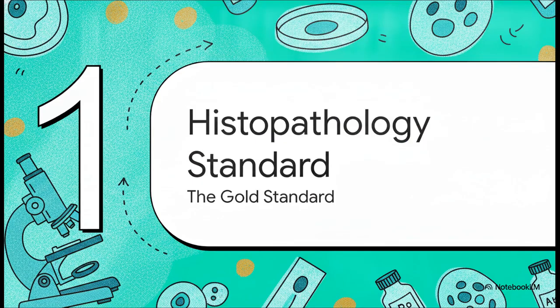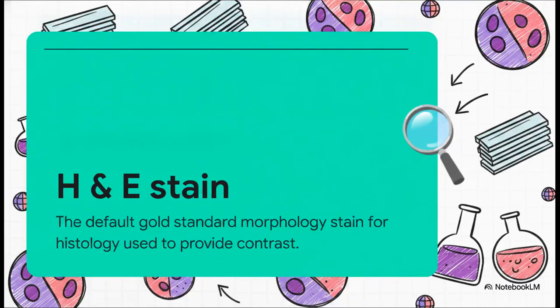Starting things off with Section 1, the histopathology gold standard. We've got to start with Hematoxylin Eosin, or H&E as everyone calls it. This is the universal default standard. It's performed millions of times a day in labs all around the world. It's the essential baseline that provides the necessary contrast to tissues and cells, allowing pathologists to make critical diagnoses.